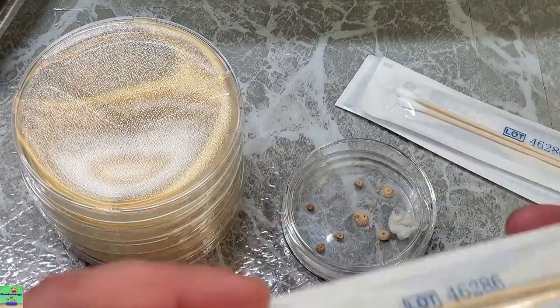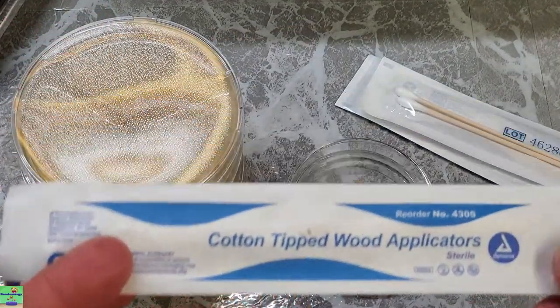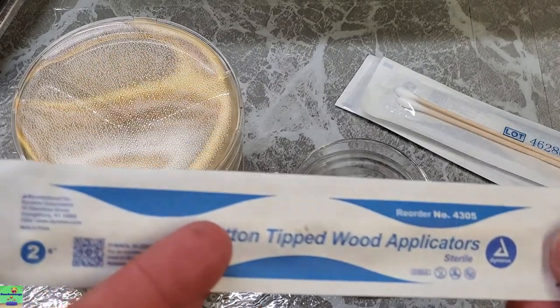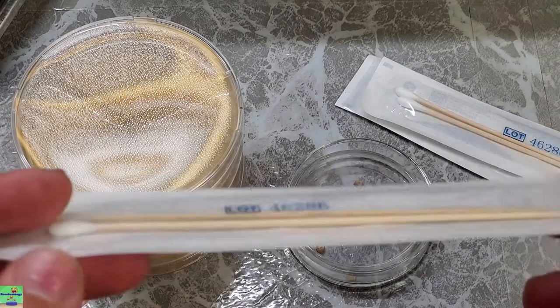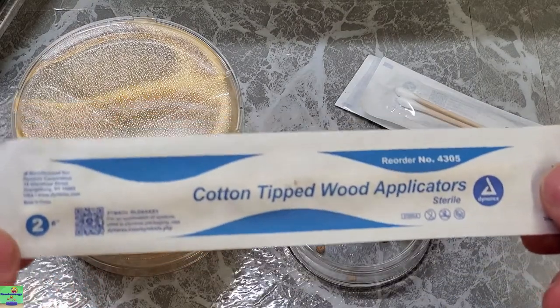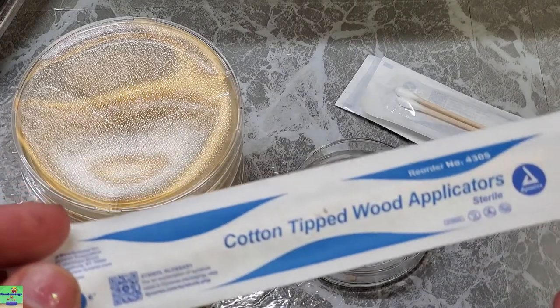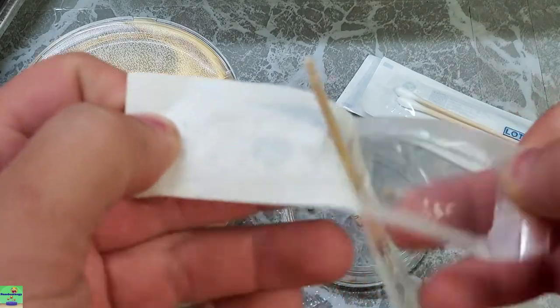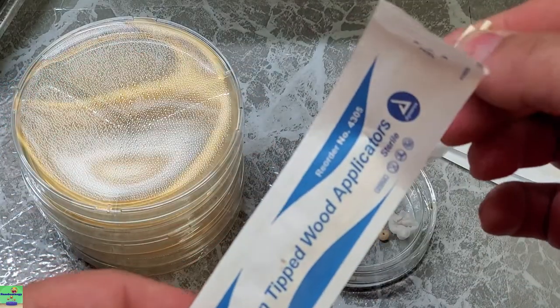So there are many different ways to do this. This is one way that I like. I just like to use the sterile cotton-tipped wood applicators. I get these off of Amazon. I think it's like 100 of them for around $16, if that. They're pretty inexpensive, and I've never had any poor experiences with these, so we want to do this as quickly as possible.